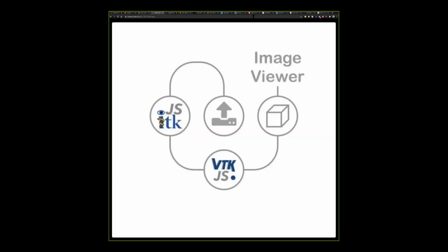You can also take this, remove the file to load, and just get the app. You're presented with a blank page, but you can click on it and select a file that's on your local computer.